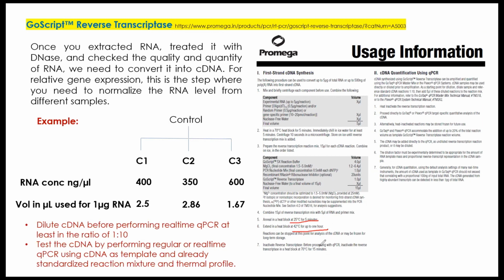And then how you can look into the process, how you stop the reaction. That is what I just wanted to explain in the cDNA conversion.